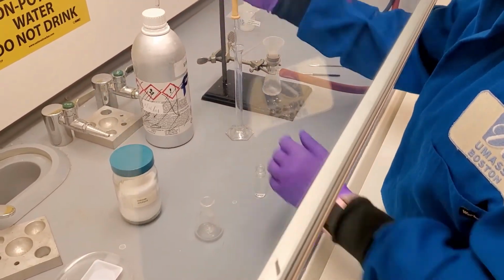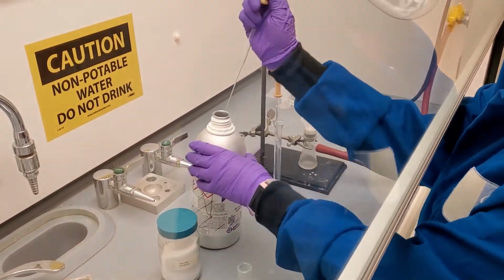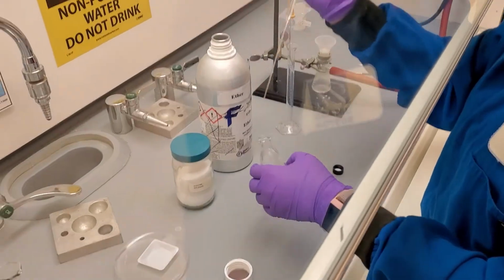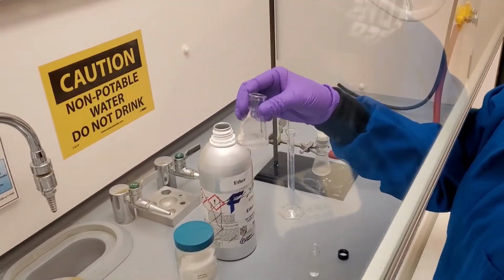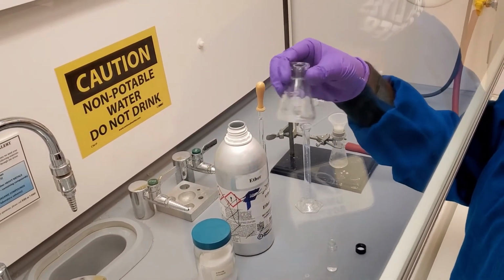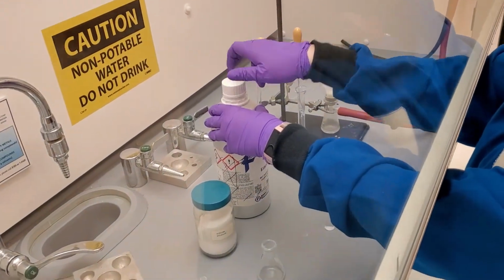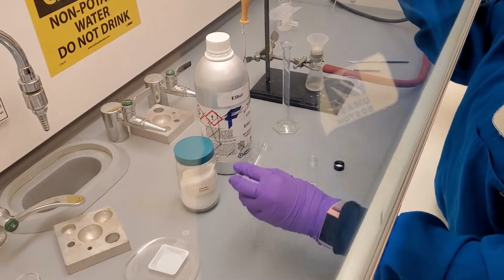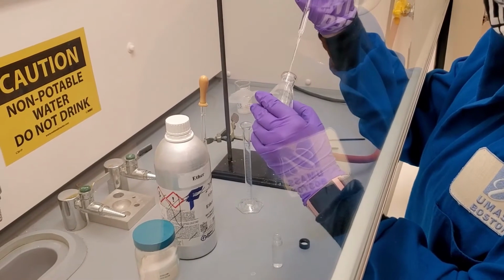In order to get the maximum amount of product, we will add about 1 milliliter more of the diethyl ether to the Erlenmeyer flask to wash the sodium sulfate crystals. One pump of the Pasteur pipette is about 1 milliliter. After swirling the ether and sodium sulfate crystals, we will again add the ether solution to the product vial.